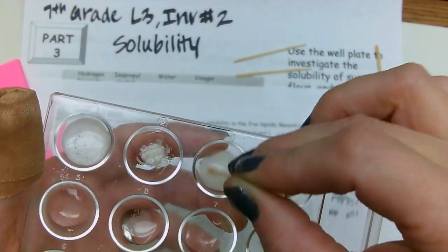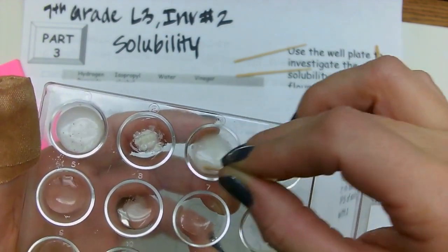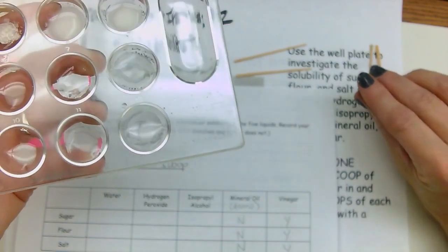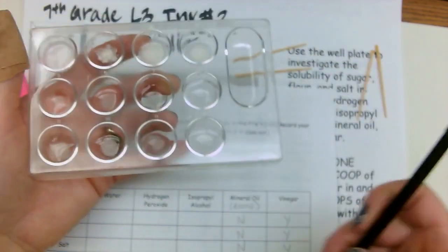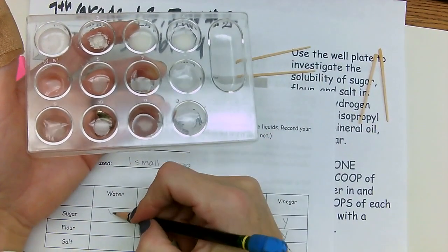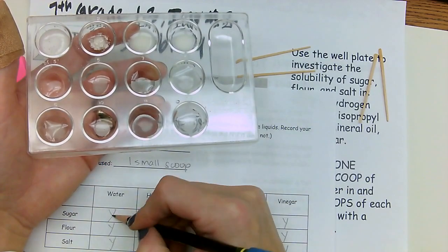And then our flour, that's a yes. Look at that, milky. Okay, so we are going to say for water, water is a yes, and a yes.